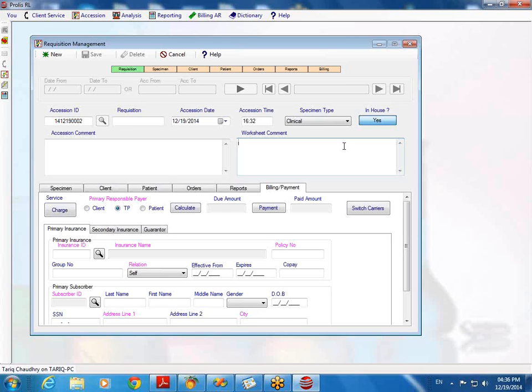Oh, I see. So it's like when you look up a patient's name, that information would already be there. Yes. So you don't have to enter it again. The reason why we don't recommend it is that it is problematic in a way. Normally patient information does not change, but seldom it does.